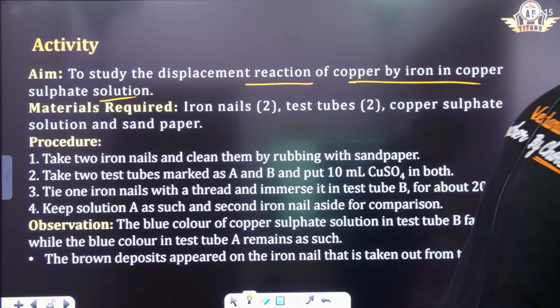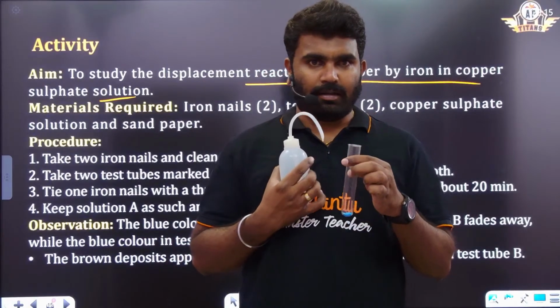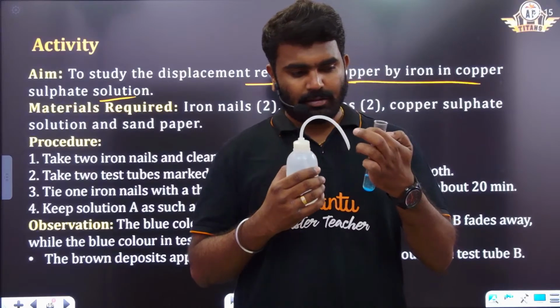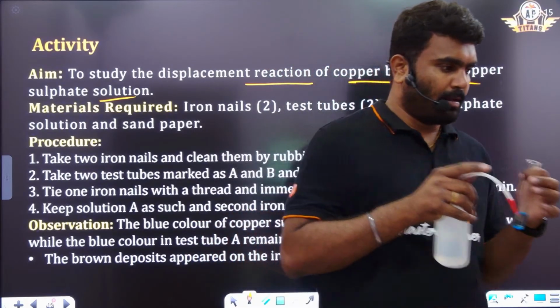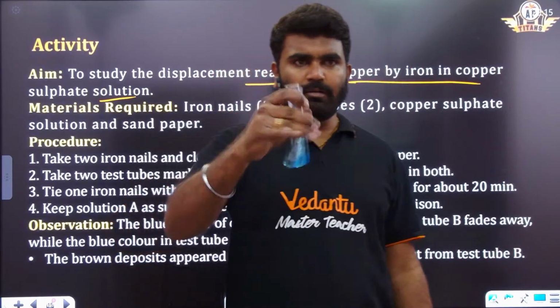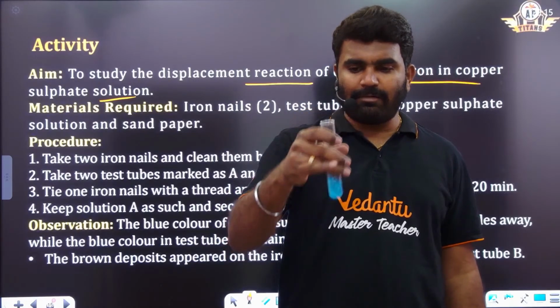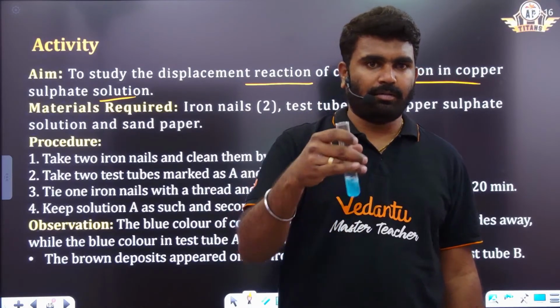With the help of this water bottle, we'll be adding some water to the solution. So now I am dissolving this copper sulfate, sorry, it is not iron sulfate.